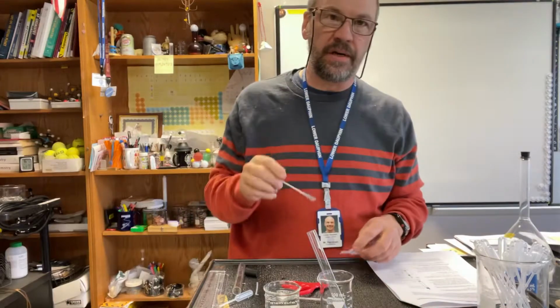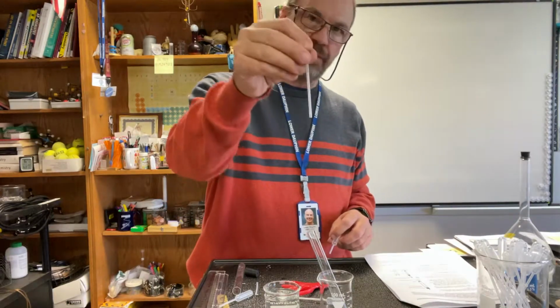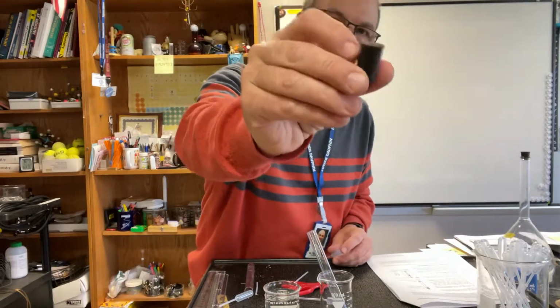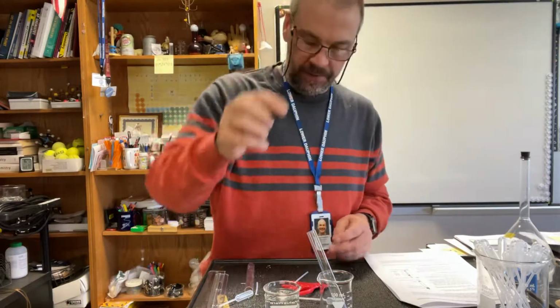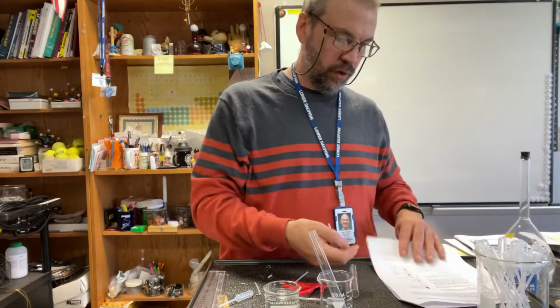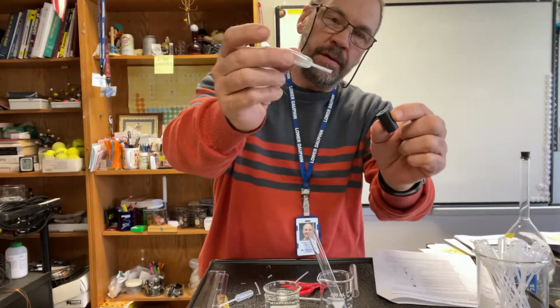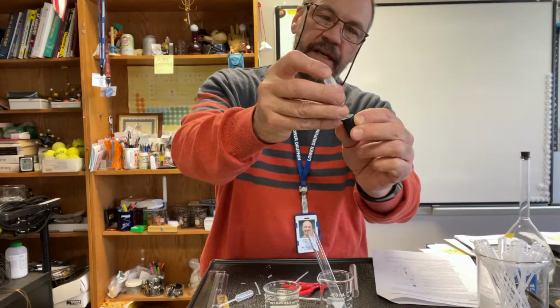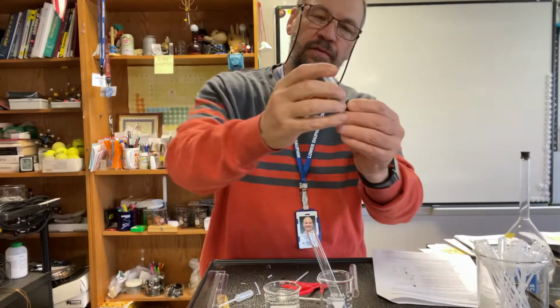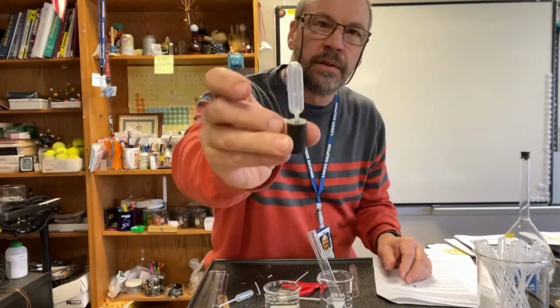In the second part of the lab, what it calls for is for you to use a straw. Well, we can just use that as our straw. Then you're going to get what we call a rubber stopper. Make sure it has a hole in the top, and a test tube. And then, if you look at the diagram there, you're just going to take your pipette and insert it into the hole of the rubber stopper and put it down there as far as you can without damaging it. So that's about as far as it'll go.